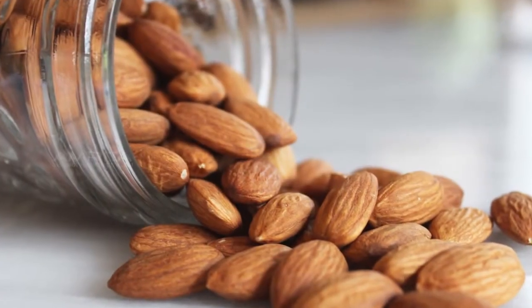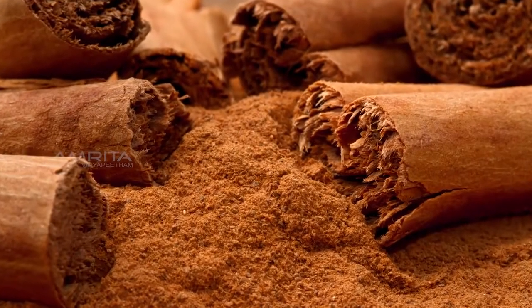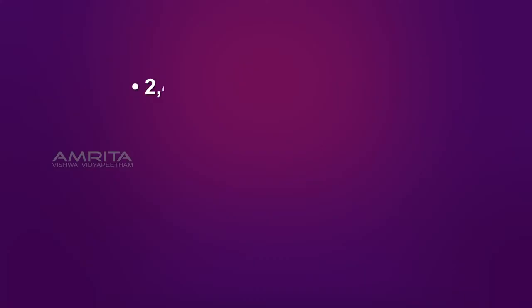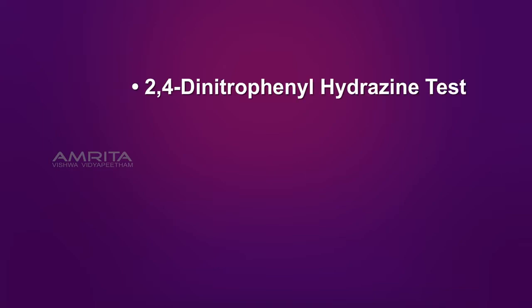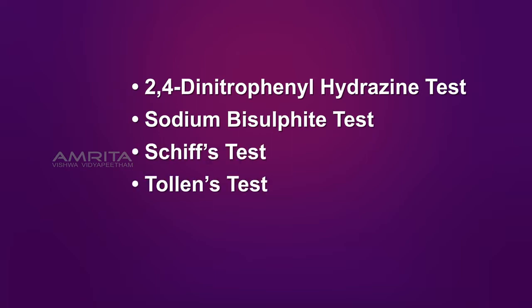The flavors of almond, vanilla beans, and cinnamon are due to the presence of aldehydes. Our aim here is to identify aldehydes using some simple tests. They are: 2,4-dinitrophenylhydrazine test, sodium bisulphite test, Schiff's test, Tollens' test, Fehling's test.